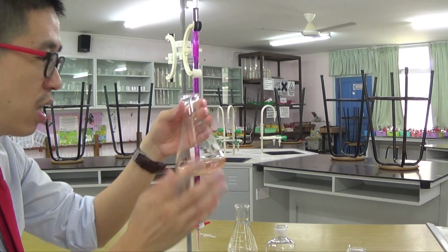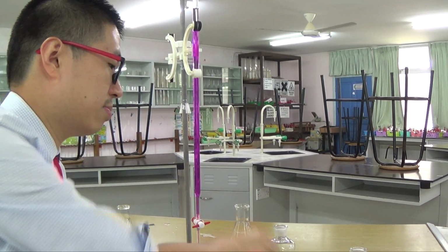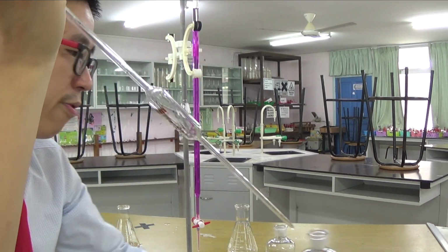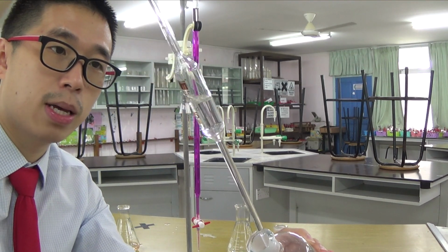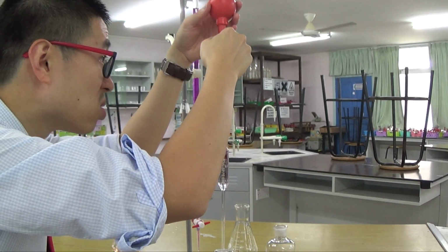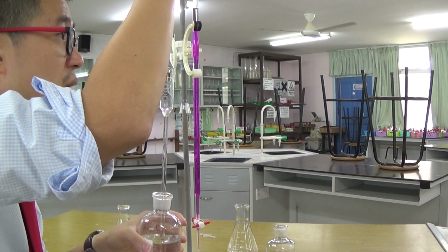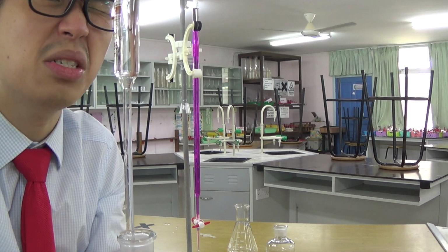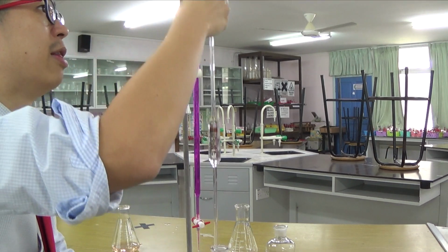Anyway, we're supposed to do 2 exact titrations, right? So I'll just draw out what I need. We need another 25 cm cube of this iron 2+ here. This one is going up quite quickly actually. So ejecting there. This thing is colorless or kind of pale green supposedly, but very dilute, so it's kind of like colorless. So you're reading below the meniscus, yeah?